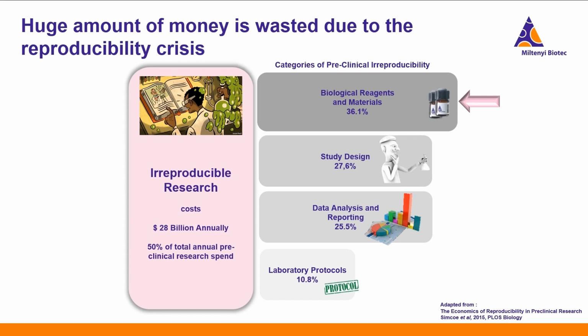In recent years, there has been a growing recognition within the scientific community of the reproducibility crisis, prompting structural changes. One notable development is the integration of AI technology to assess the reproducibility of scientific publications. This innovative approach involves assigning confidence scores to publications, providing a quantitative measure of their reproducibility. However, while such advancements are promising, it's essential to acknowledge that achieving more reliable and reproducible results requires a comprehensive examination of the reagents used in scientific experiments.